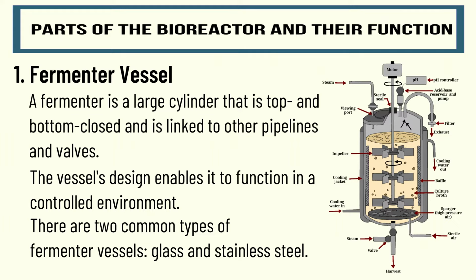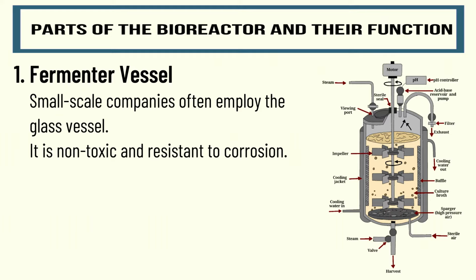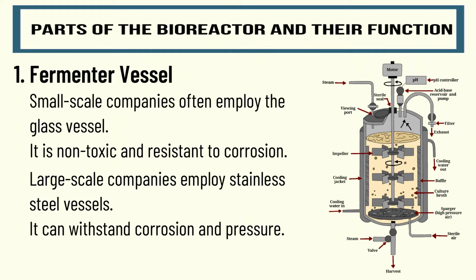Small-scale companies often employ the glass vessel. It is non-toxic and resistant to corrosion. Whereas the large-scale companies employ stainless steel vessels, which can withstand corrosion and pressure.